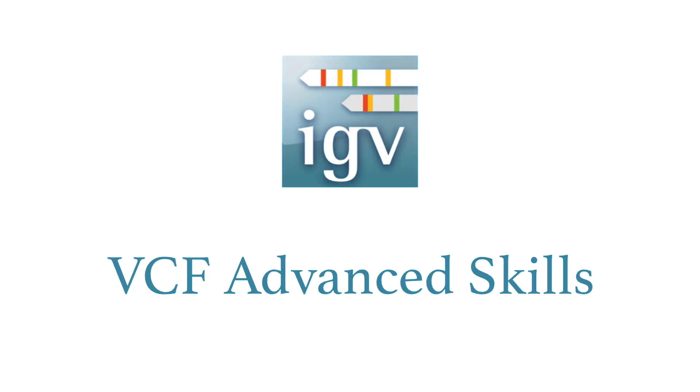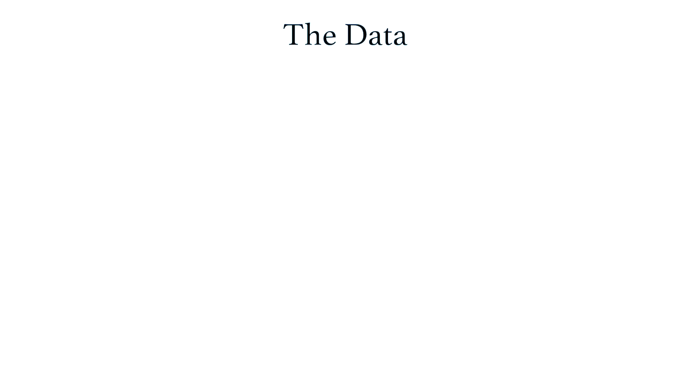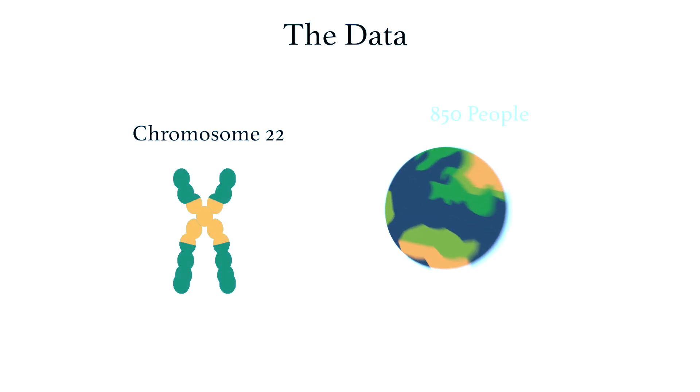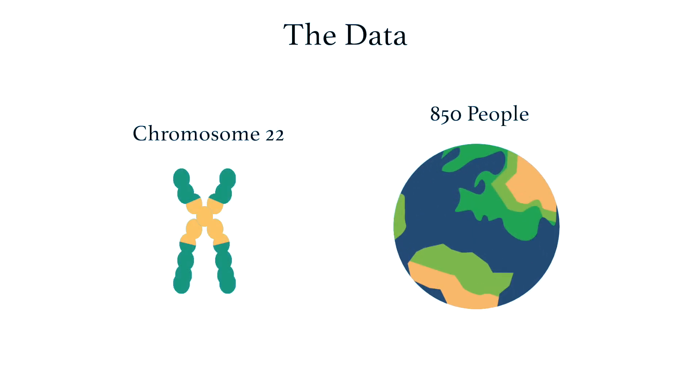Here, I'll show you a few more advanced skills when it comes to viewing VCFs in IGV. To cover these topics, we're going to use a VCF file with variant data on chromosome 22 from about 850 people from all around the world, and IGV is going to help us find interesting patterns in this data. Let's begin.